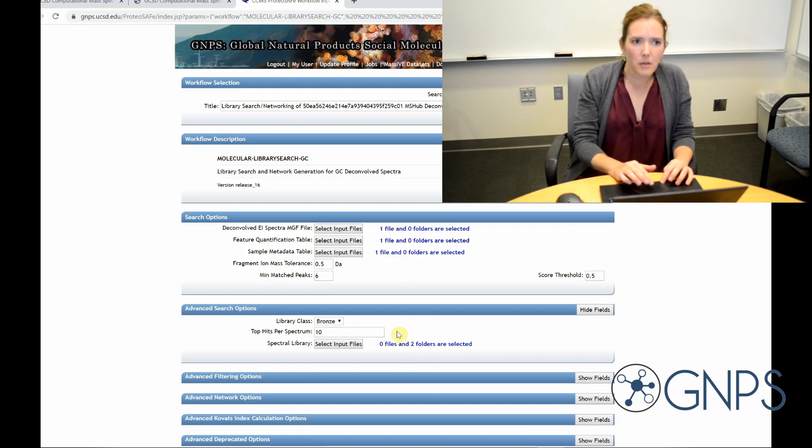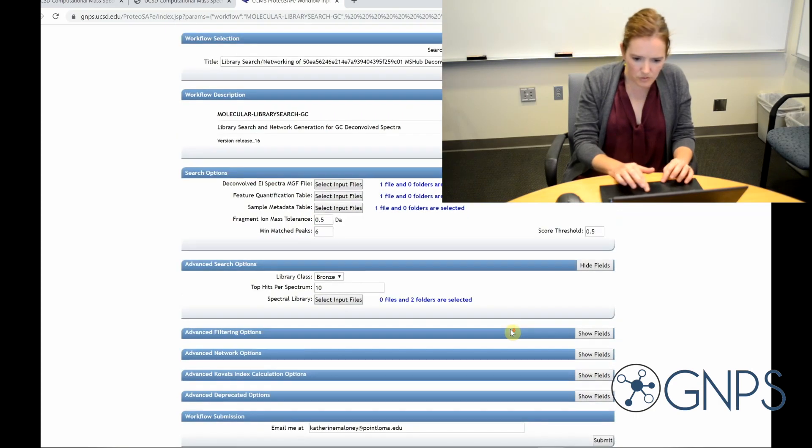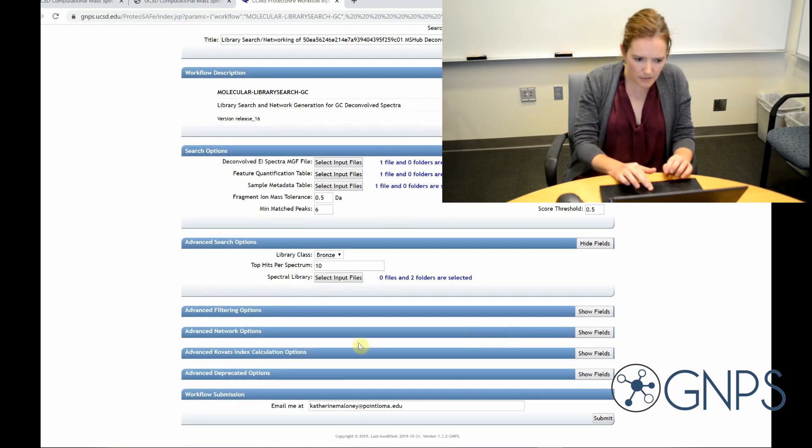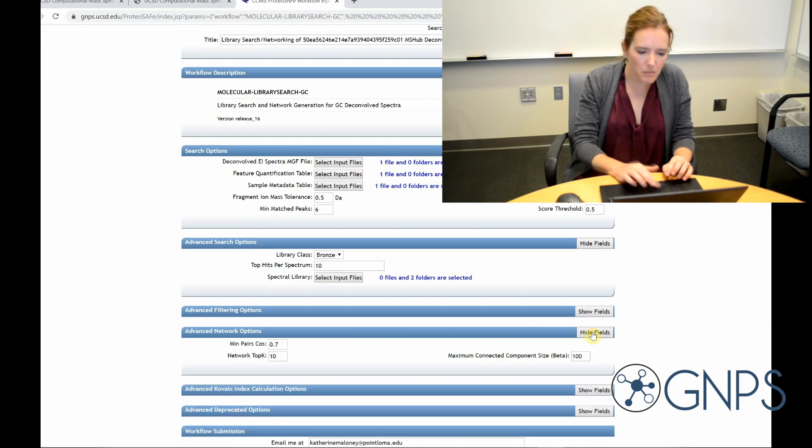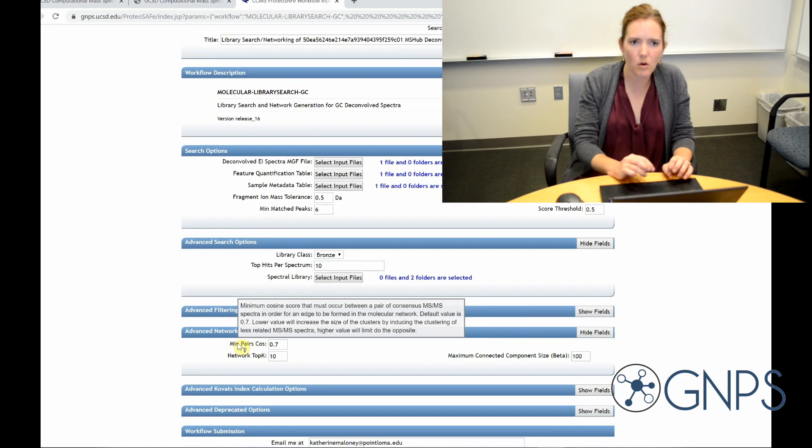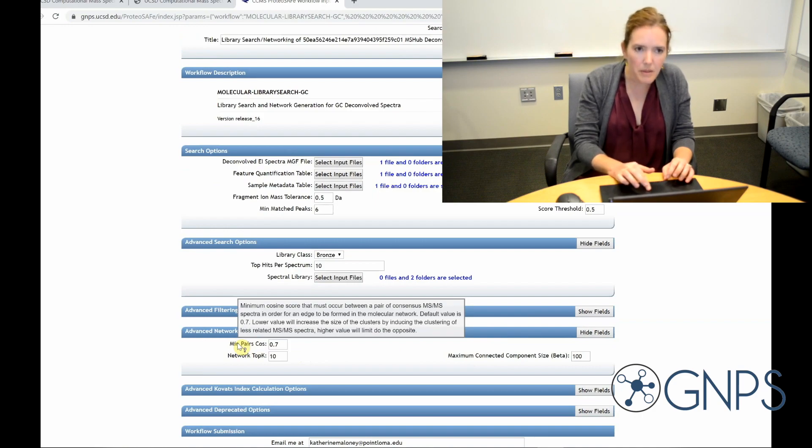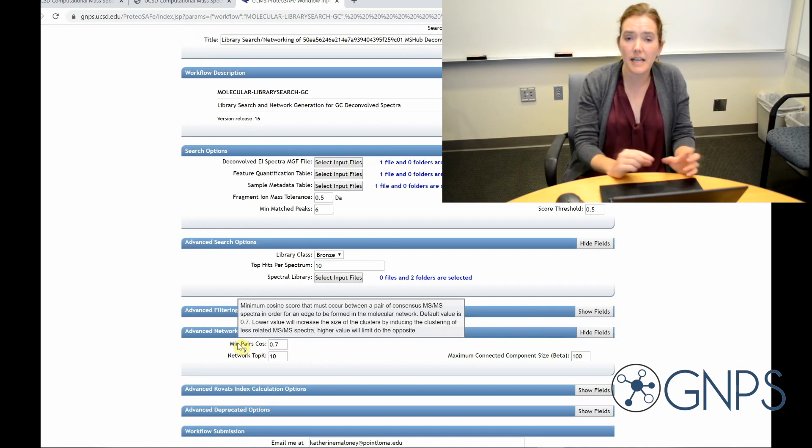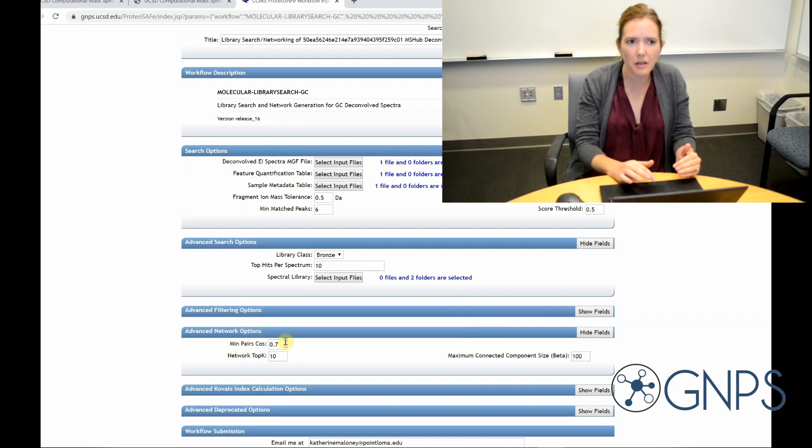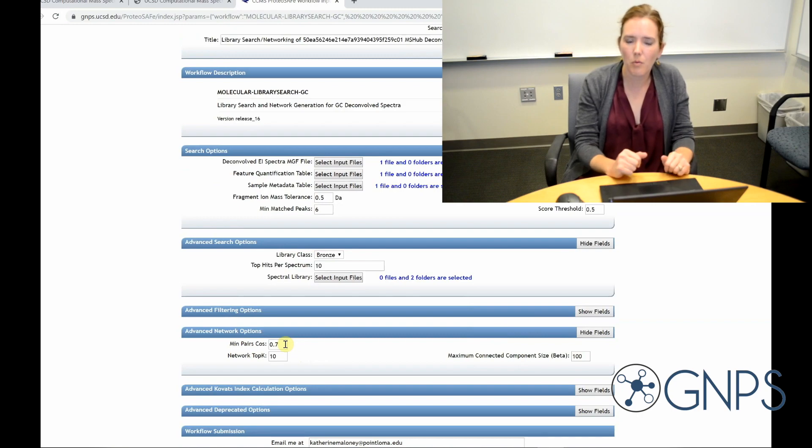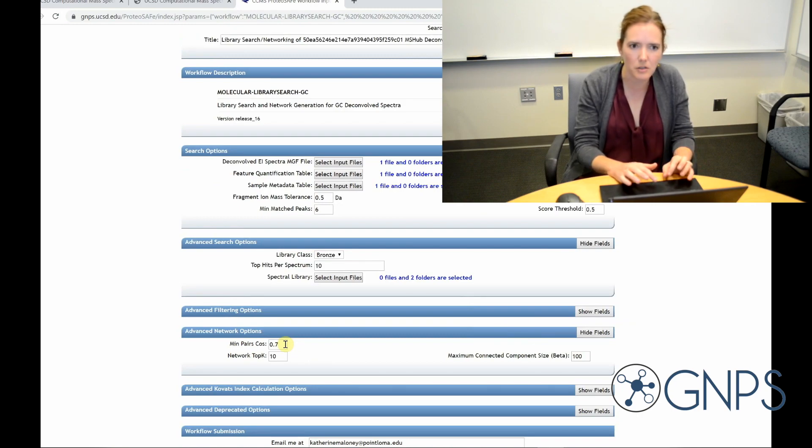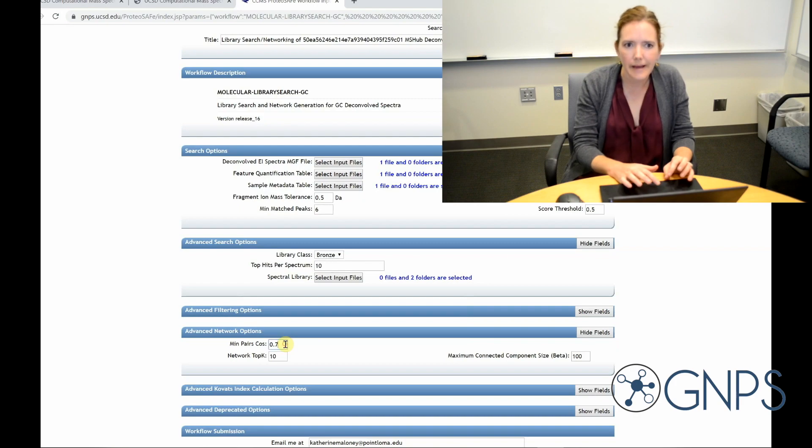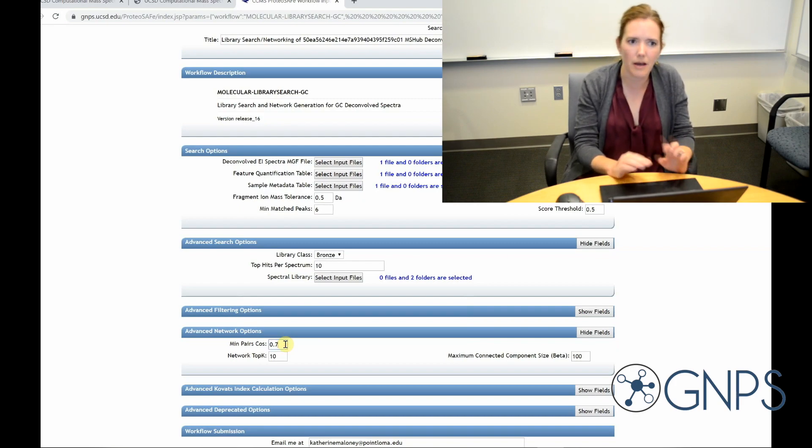If I'm going to build a molecular network for my data, I can also choose those settings here. The minimum pairs cosine, or the cosine similarity score, is saying what the minimum score is required in order to connect two nodes or features in my network. The higher this value is, the more selective it's going to be about which spectra are connected, resulting in smaller networks of highly similar spectra. 0.7 is kind of a nice place to start. We can always adjust it up or down later if we aren't happy.